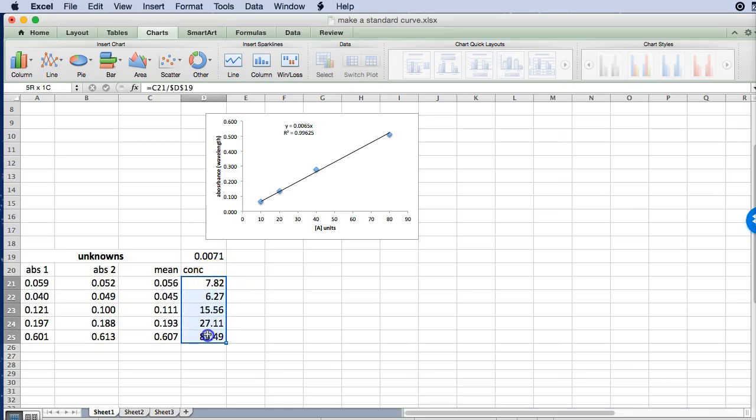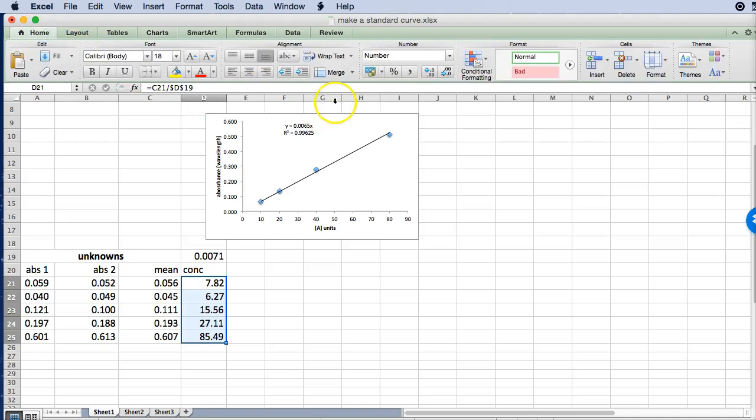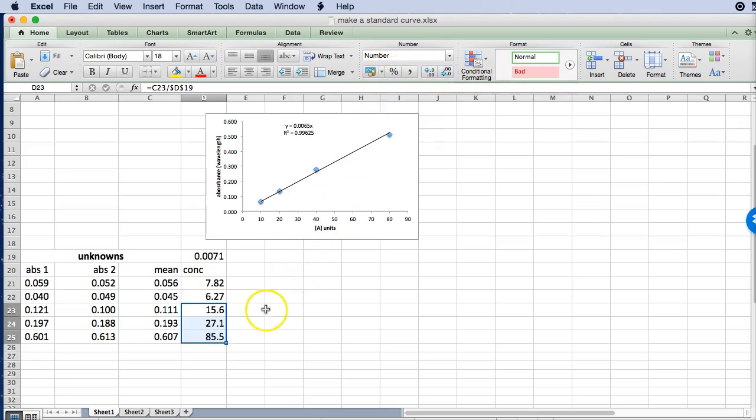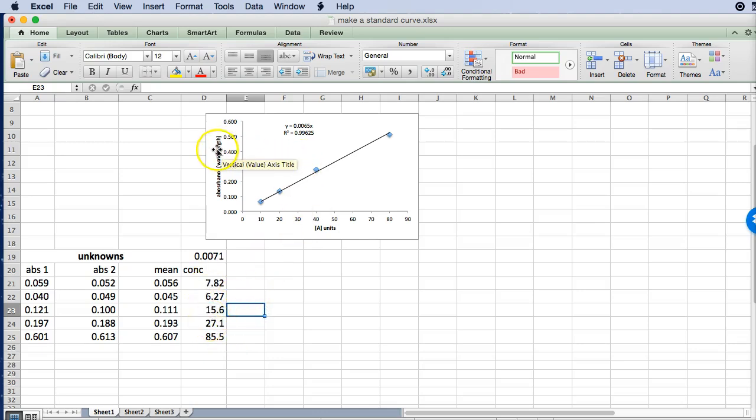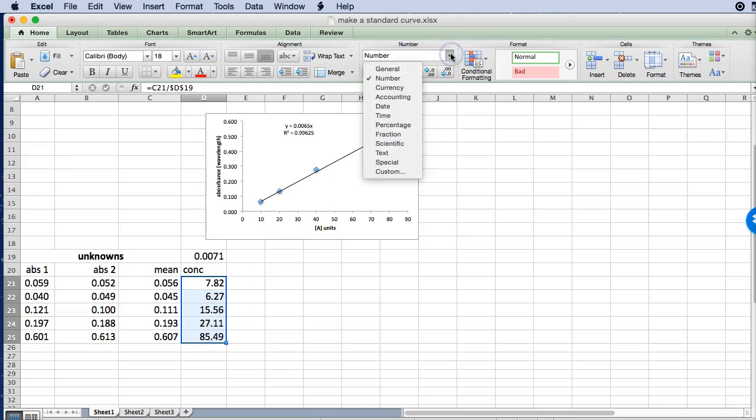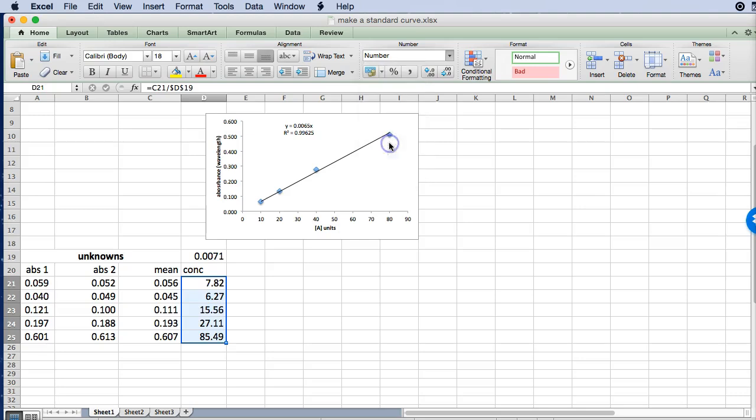So I'm just going to select them all. One way would be to just change the number of decimals in these cells. And we just reduce that by one. So that's a quick and dirty way which often is enough for something small like this.